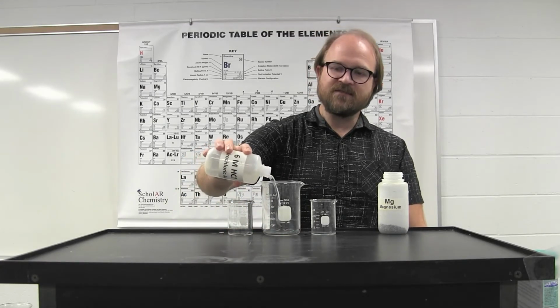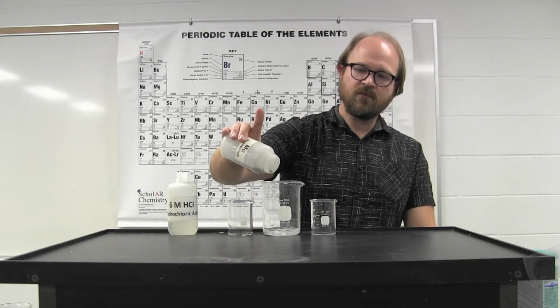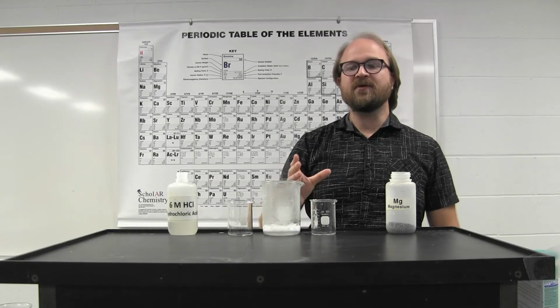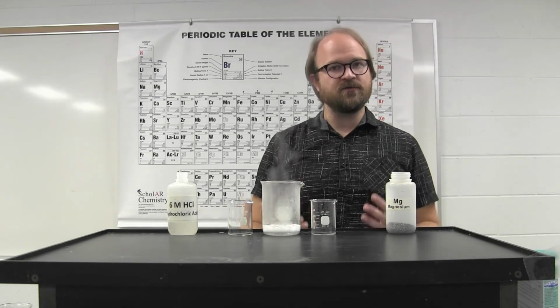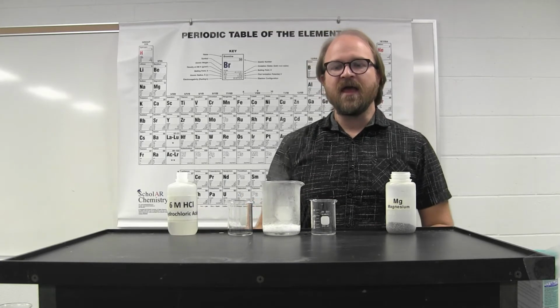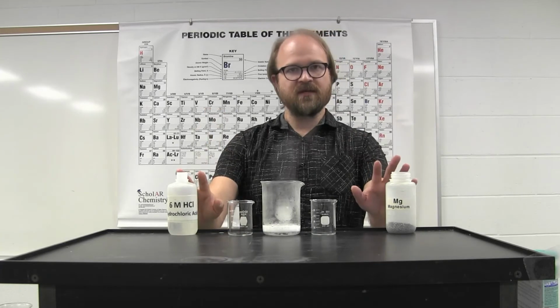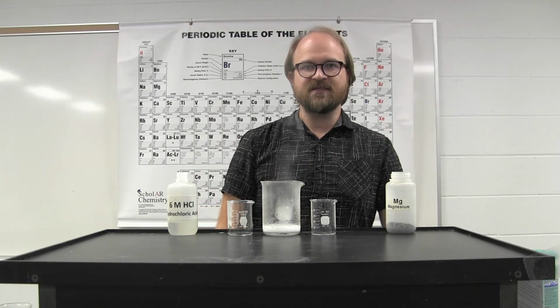So by mixing these two together, the reaction can progress. And you can see that it's generating the hydrogen gas, it's bubbling, it also generates a lot of heat. And the limiting reactant is the initial reactant that's going to dictate when the reaction stops.